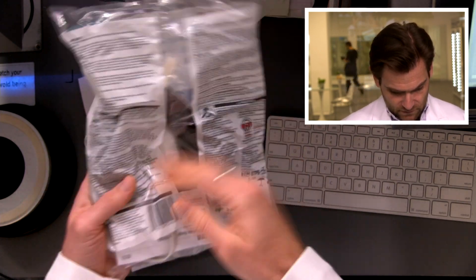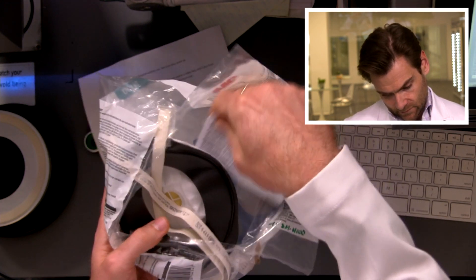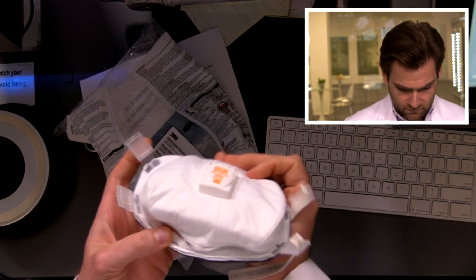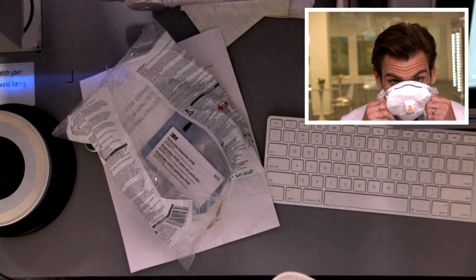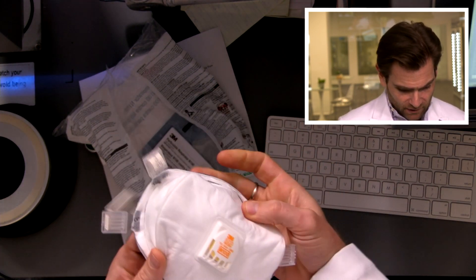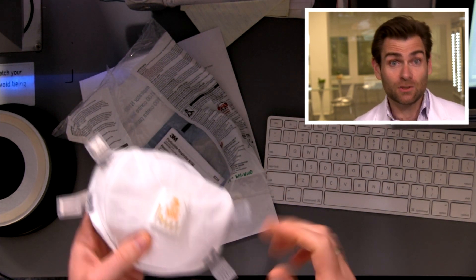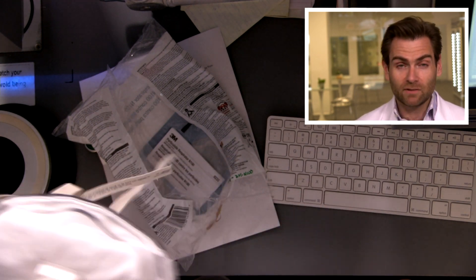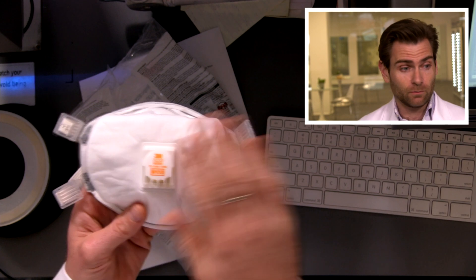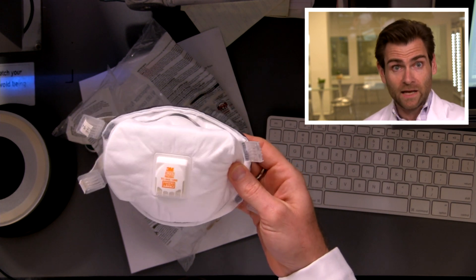Here's the bag — it comes sealed very nicely. Open it up, it's got the instructions. Look at that. It's legit right there. This one has a valve. You may have heard that the CDC says not to use valves because if you're breathing out, it can expel COVID if you happen to have it — which they now say you can fix by putting a surgical mask over the valve, which would save the rest of the world from your nasty COVID breath.